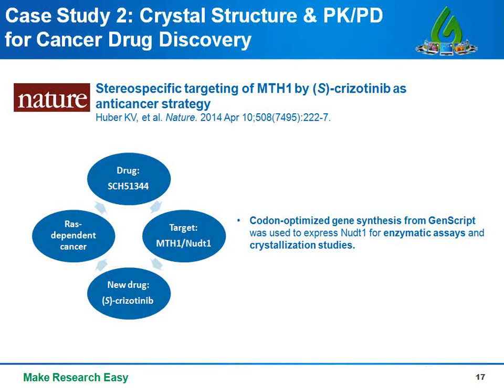And again, I recommend checking out this paper for its really elegant full circle approach, and of course the fact that the codon-optimized gene was used for different types of assays, including crystallization and enzyme activity.